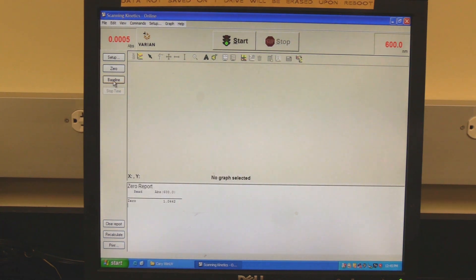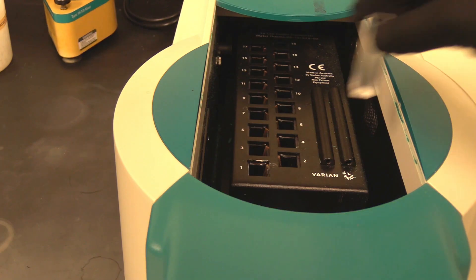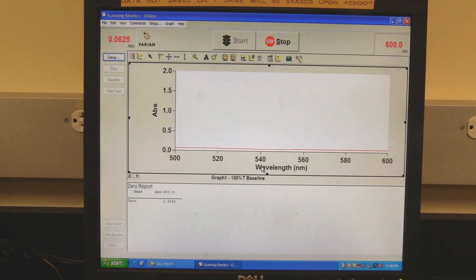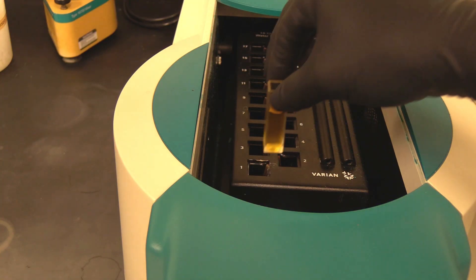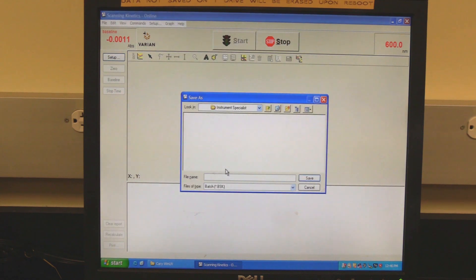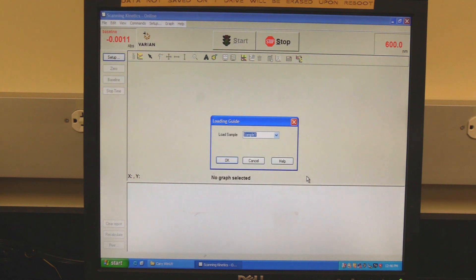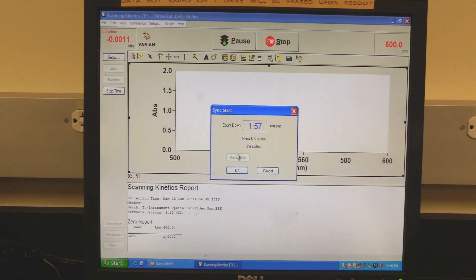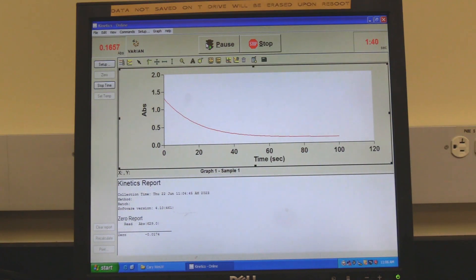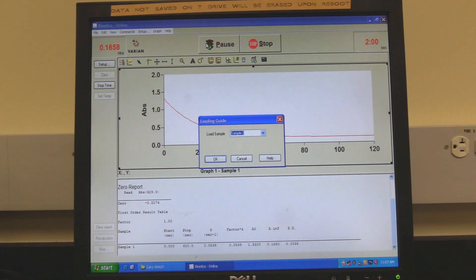Click on the Baseline button. The software will prompt for the operator to insert the blank cuvette. Insert the blank cuvette in the sample chamber as demonstrated in the wavelength scan measurement. Click on the Start button. If Save at Start was selected, the software will prompt the operator to save. Find the appropriate folder, name the file, and click Save. The software will prompt for the sample name — click OK. The countdown timer will appear. Add the reaction reagents to the cuvette in the sample chamber and click OK. Wait for the measurement to finish; the spectrum will appear. The software will prompt for the next sample name — if measuring another sample, click OK. The report area will have the calculated data.